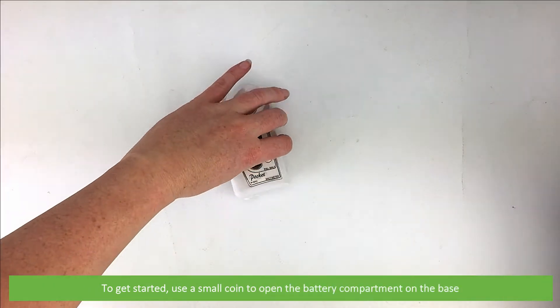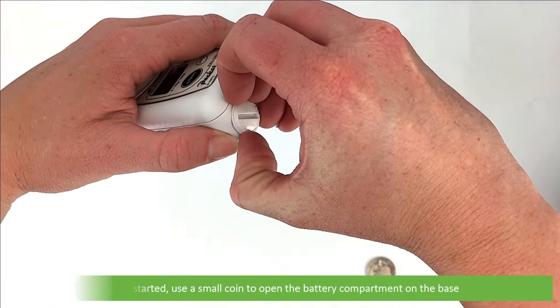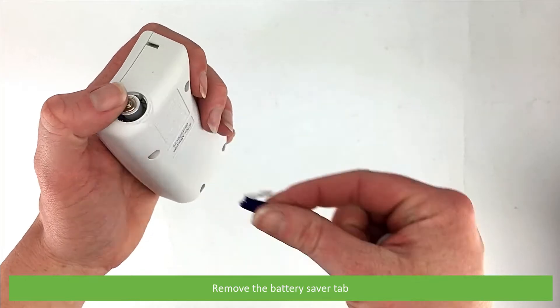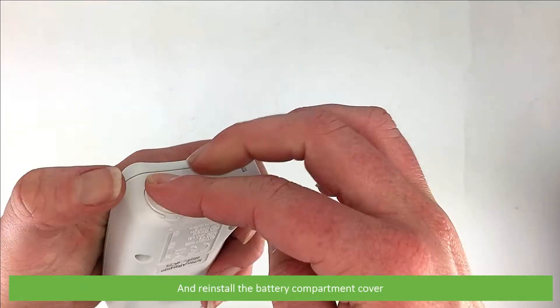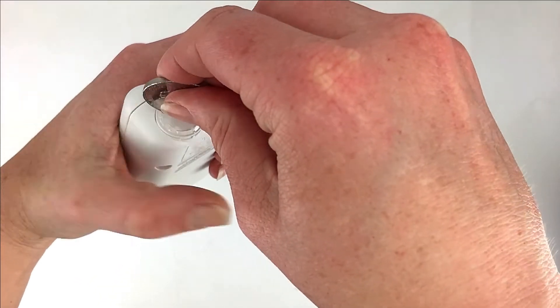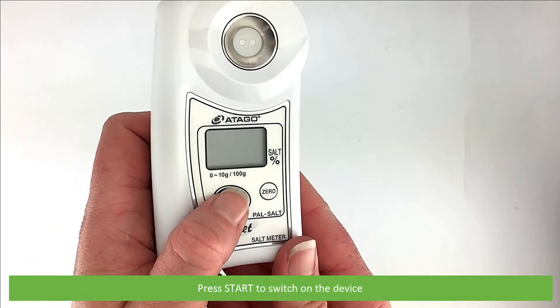To get started, use a small coin to open the battery compartment on the base. Remove the battery saver tab, then reinstall the battery compartment cover. Press start to switch on the device.